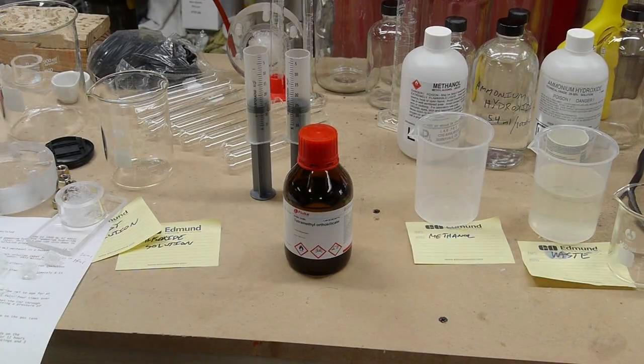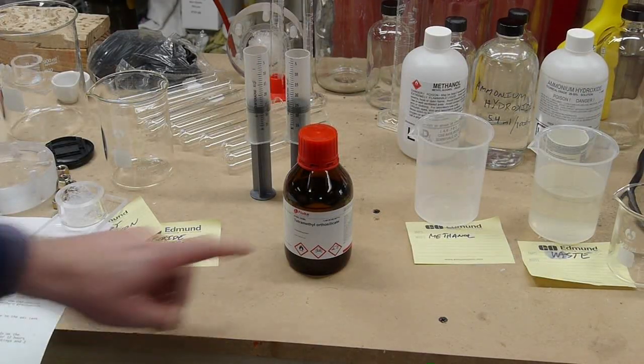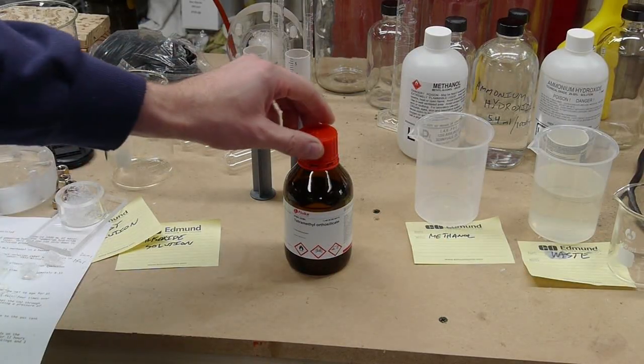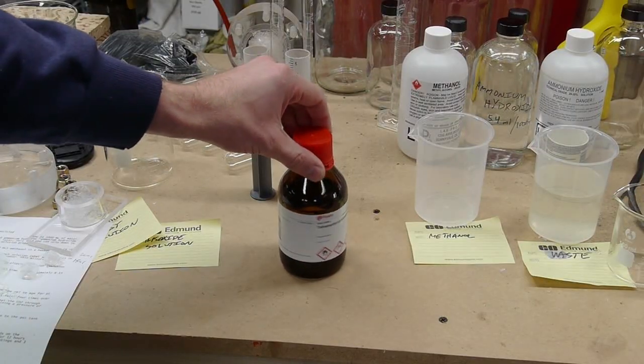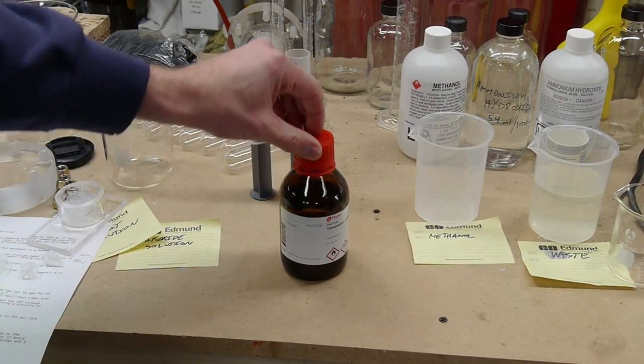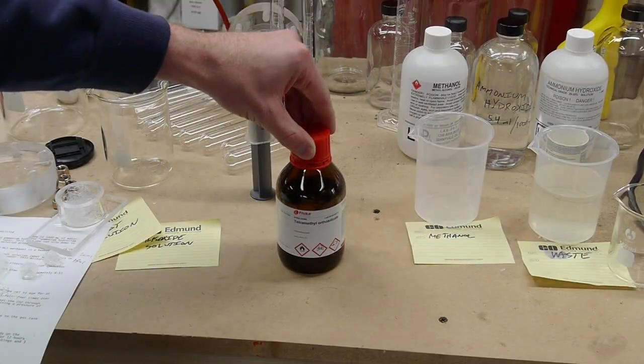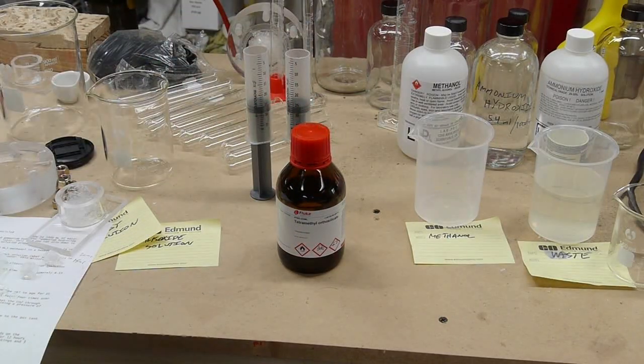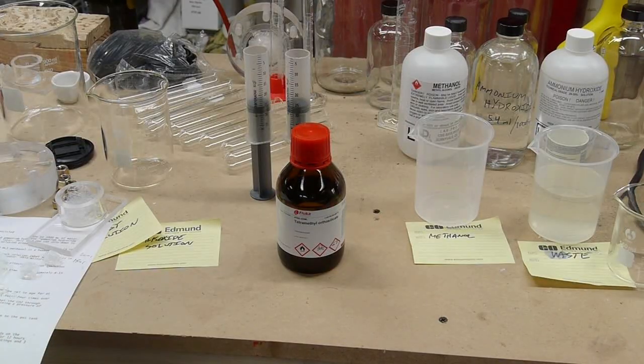I got my recipe for this aerogel off aerogel.org, and using tetramethyl is one method and using tetraethyl is another. But getting either of these chemicals is quite difficult. So if you're really interested in aerogel production and you happen to live close to me, maybe come by my shop and I might be able to share some of this since I have quite a bit. This is 250 milliliters of chemical, which is enough to make probably 20 batches of aerogel of the quantity that I just showed you.